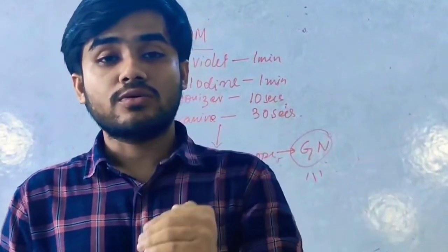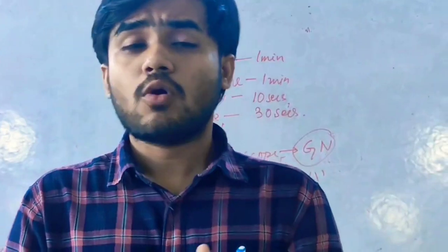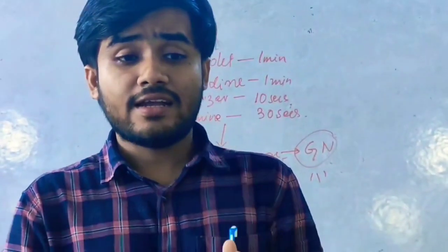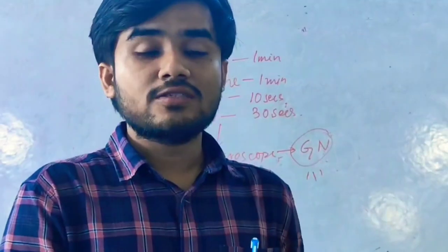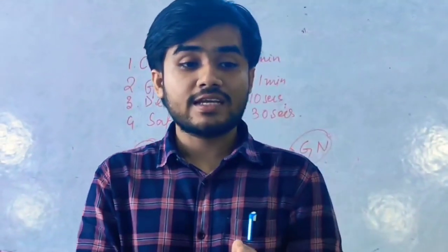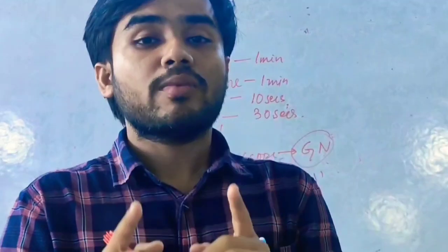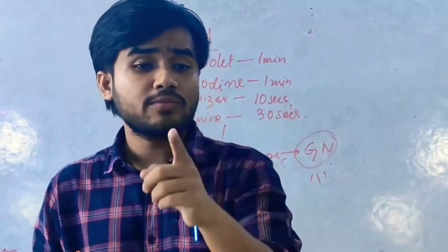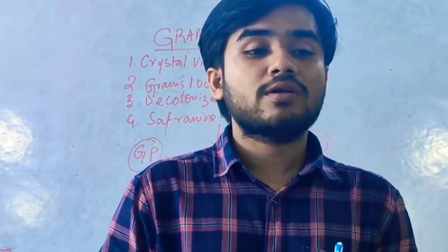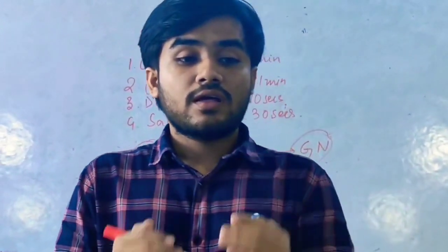And if we see Gram negative bacilli, then the first step is oxidase and catalase, followed by motility. So if catalase is positive and oxidase is negative and the organism is non-motile, and on MacConkey agar we see a lactose fermenter, then we'll think of it as Klebsiella. If it is a non-lactose fermenter and catalase positive, then we can think of Shigella.